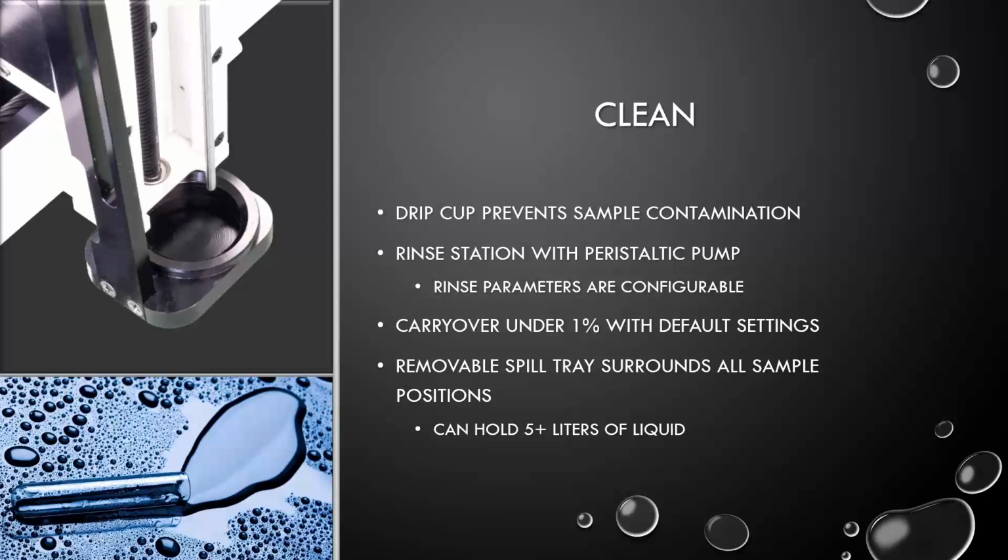So it serves as the spill tray. It's very easy to simply lift the spill tray off of the base. You can take it to a waste container, pour it out, wipe it all down, and put it back on. You're ready to go.